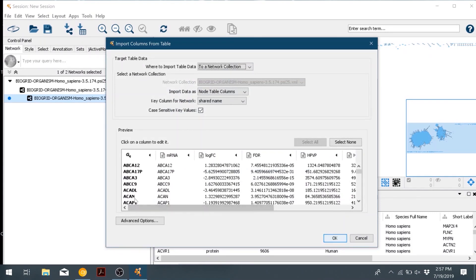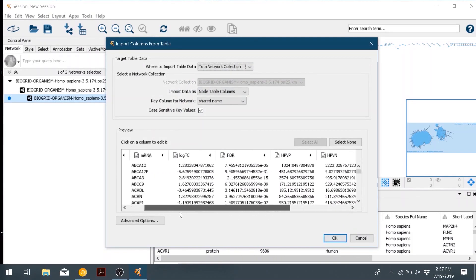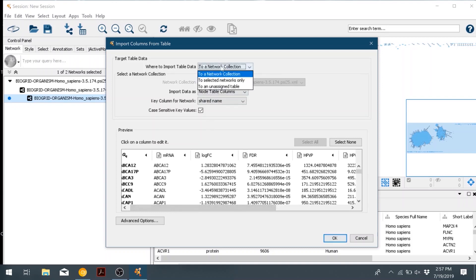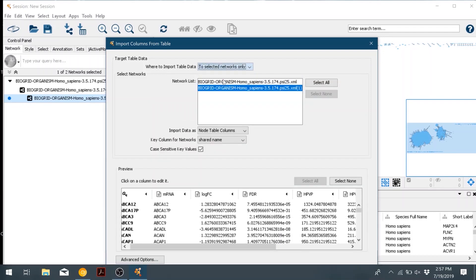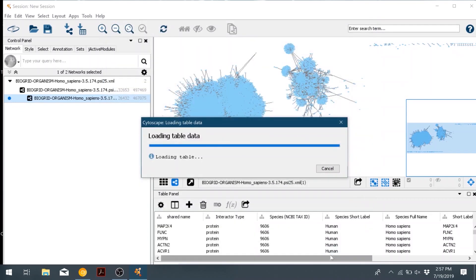In the box that pops up, it shows us all of our data that was in this CSV file for the gene expression. The bolded column is the key column. That is what is going to try and match with the data from the BioGrid. So it's going to match based on the name of the gene to merge the two data sets together. So we'll go ahead and import them to both networks, and then click OK.